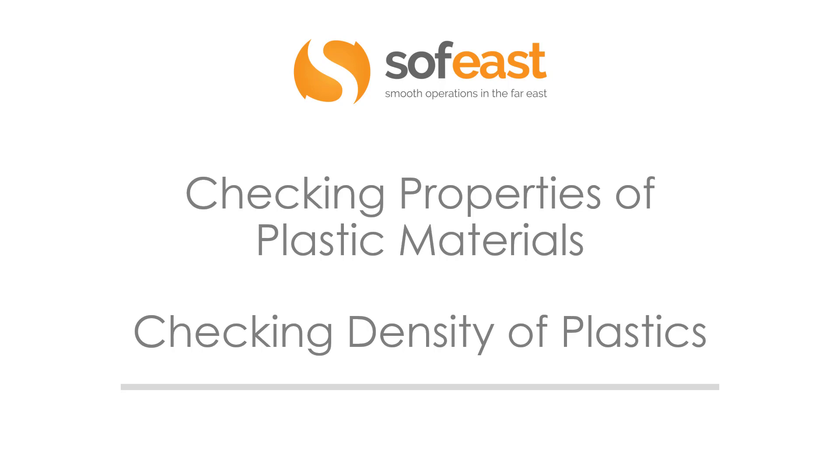Hello and welcome to this video. My name is Paul Adams from Sofeast, and today we're going to be checking properties of plastic materials, focusing on checking the density of plastics.